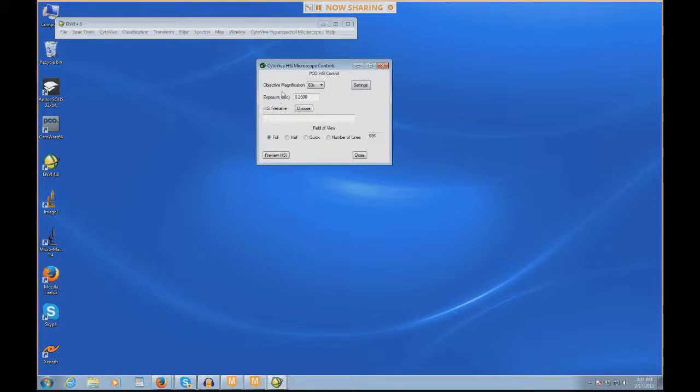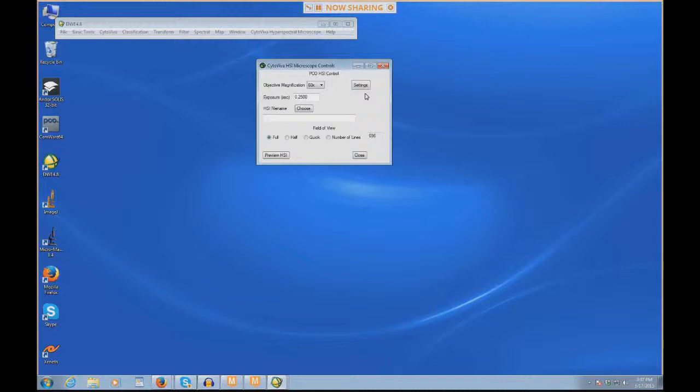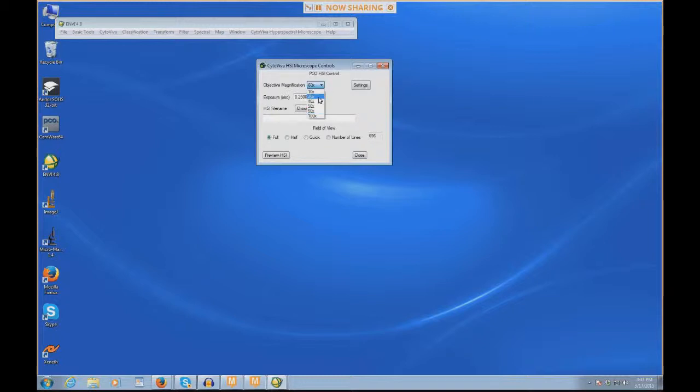And here we see quite a few options, such as objective magnification, exposure time, file name, field of view, and some setting options, which we'll go over in a bit. Here on the microscope, I actually have a slide with some 50 nanometer gold particles, and they are focused here at about 60x.